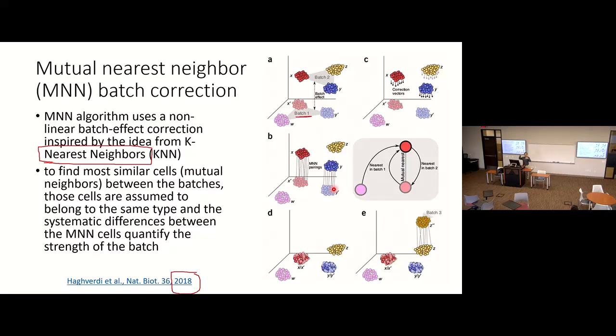So 2D, 3D, you can have a higher dimension, but you cannot see it. All you change is the location of cells. You don't change the expression level. You don't change the original expression matrix. The UMI matrix is still the same. So why are you moving cells around to cheat yourself? I still don't know why they do this.